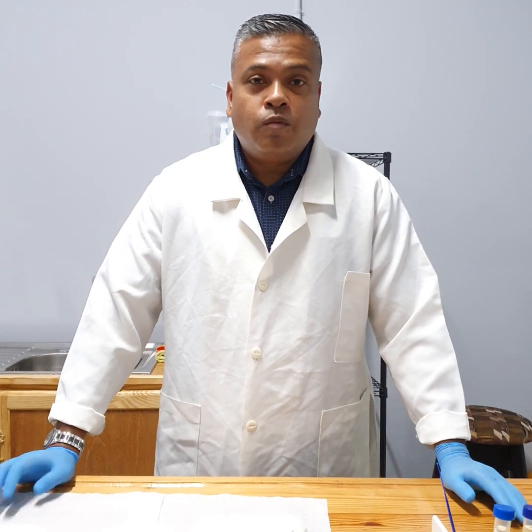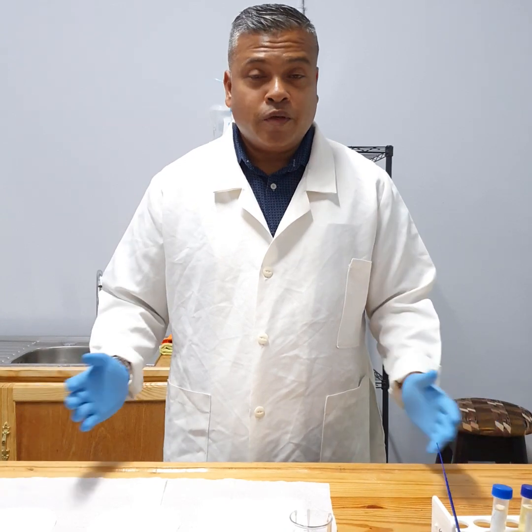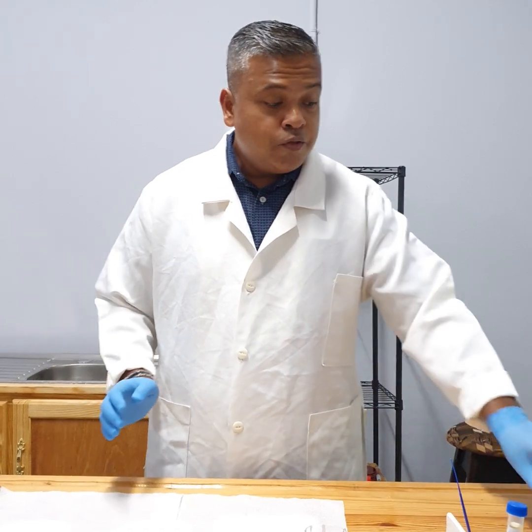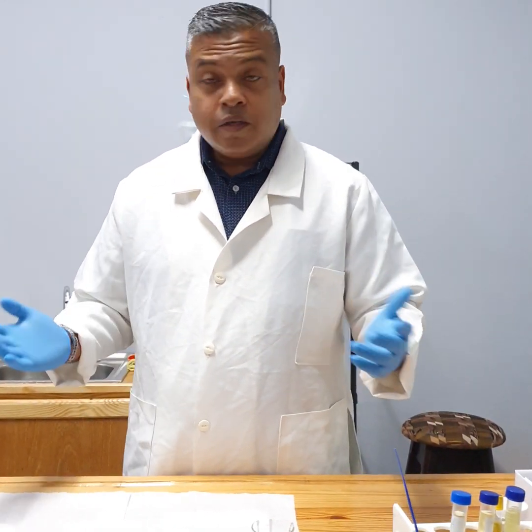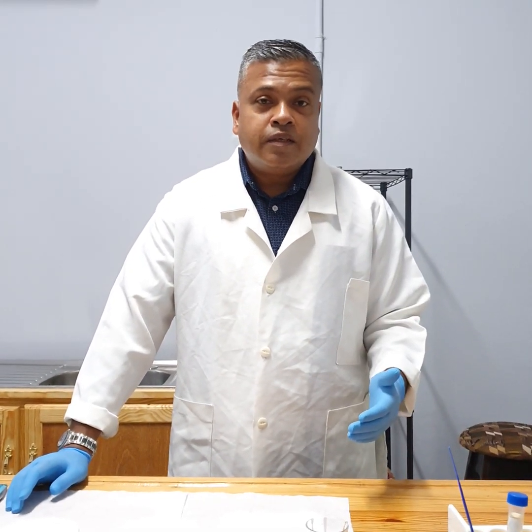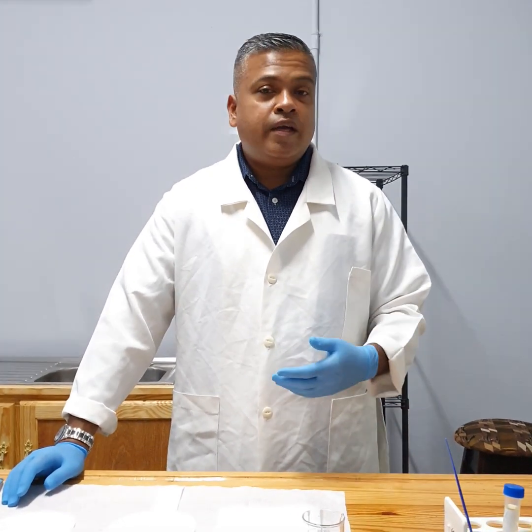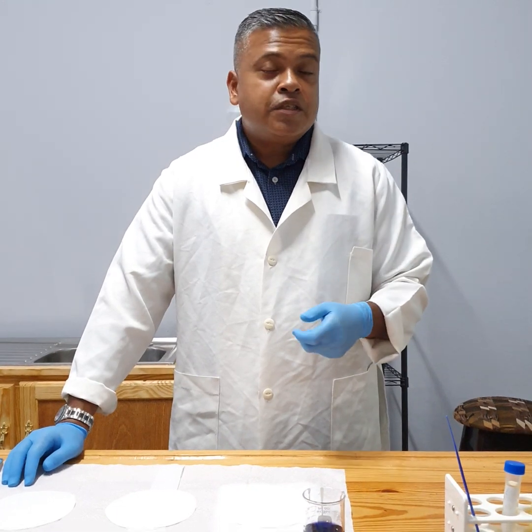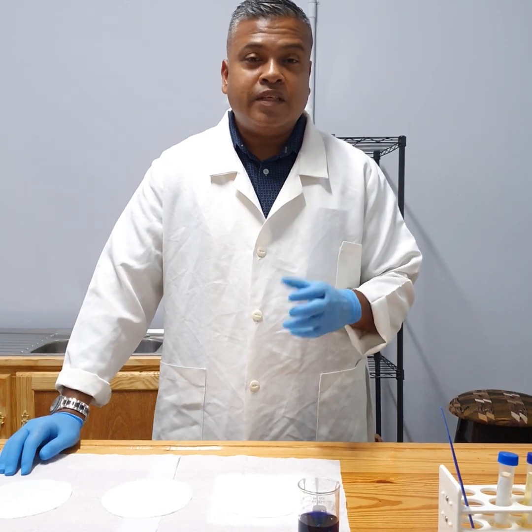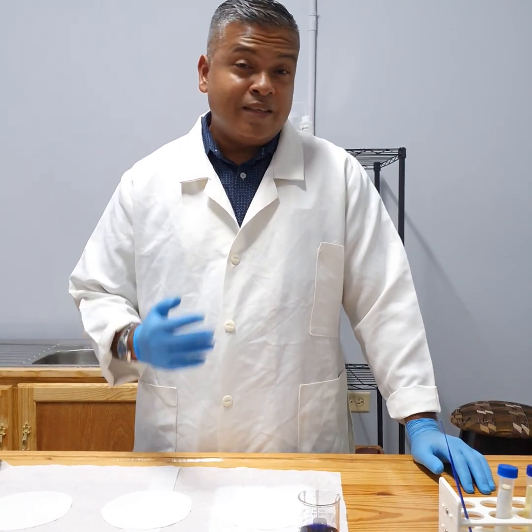We most of all will first know that in the laboratory tests are done, and these tests are performed on different types of specimens. The most common laboratory specimen is a blood specimen, but you've got urines, you've got other types of specimens. But in its simplest form, in the laboratory, tests are performed on clinical specimens where a result is obtained. But I want to just impress upon you how scientific and how diagnostically important even the protocols and the procedures are. Today I want to talk to you about pipettes and what we call analytical pipettes.